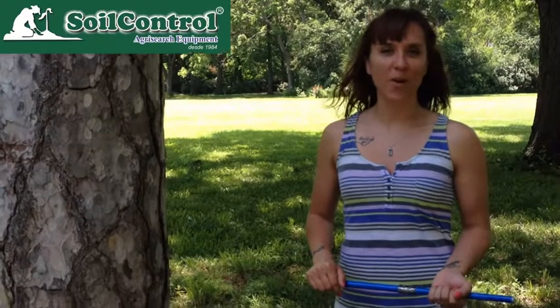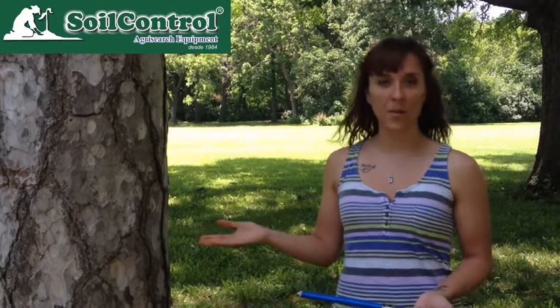Hello, I'm Dr. Lacey Gerhardt-Barley and I work with the Paleo Environmental Lab at Kansas State University. Today I'm going to demonstrate how to collect a core sample from a tree for isotope analysis or other dendrochronological work.